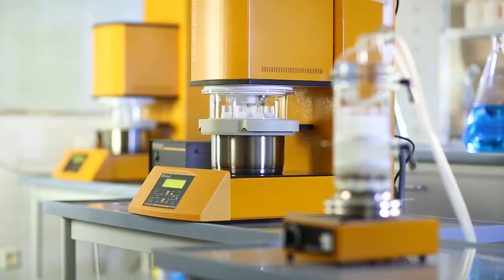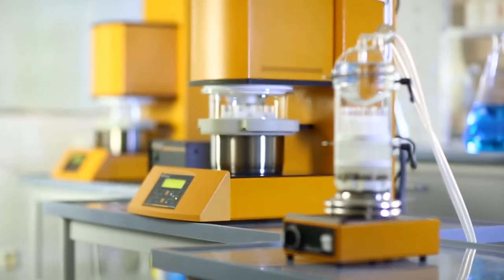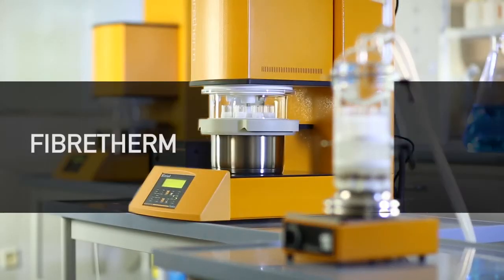A small, smart system for lower sample throughput, and our automated fiber-therm system.